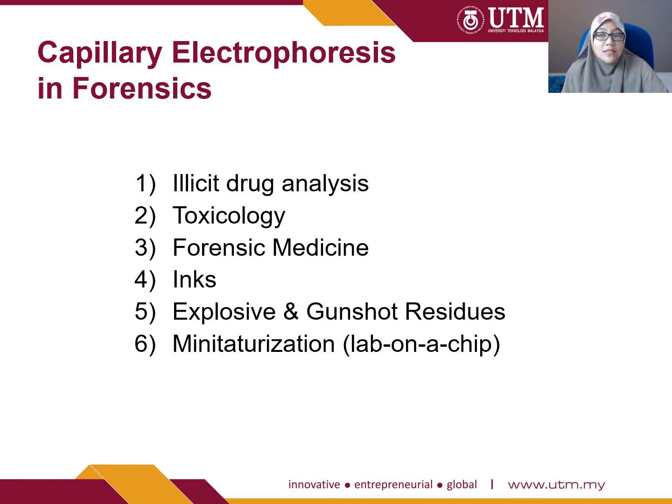So these are all the 6 areas that capillary electrophoresis has been used in the field of forensics. Next, we'll focus on what capillary electrophoresis is, the mechanism, and how analytes behave in the CE.